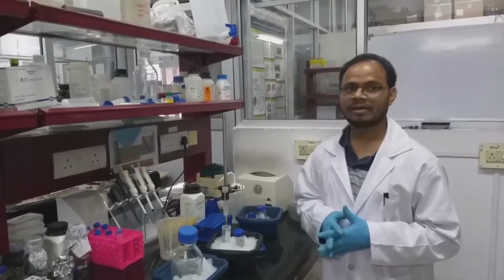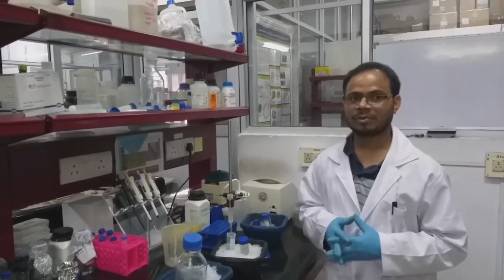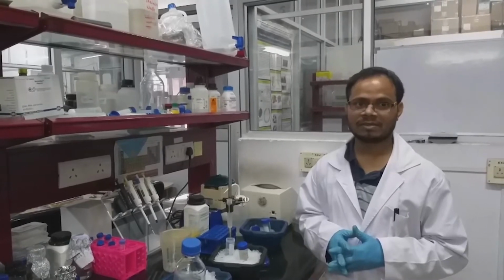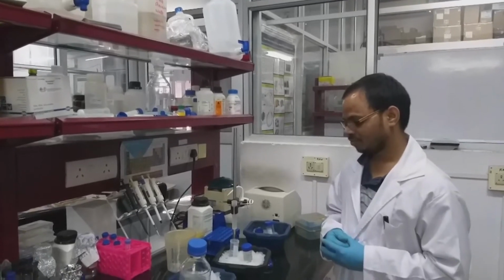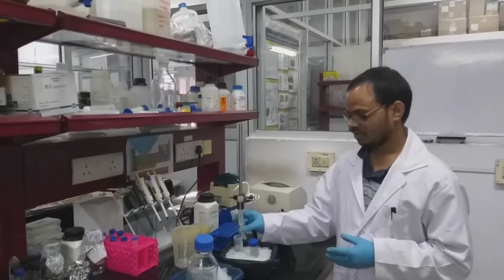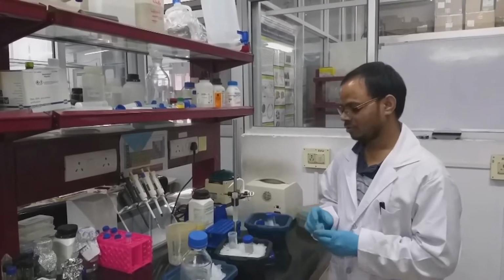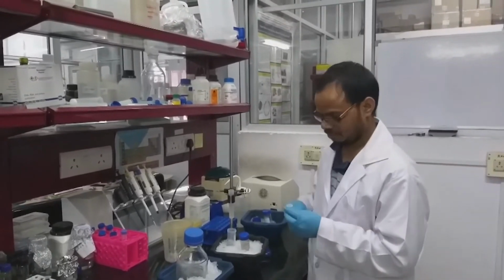Say you are getting only 10% of the protein in your purified fractions and 90% of the protein is eluting in the flow through. At that time you can reuse the flow through for purifying the protein again. So you have to collect the fractions in small microcentrifuge tubes, and we have to label those fractions and save them.